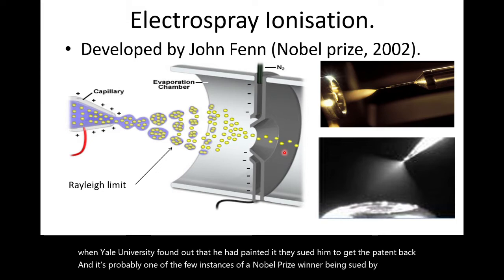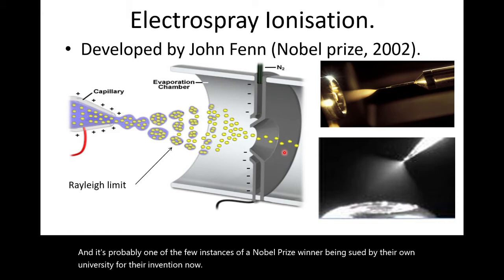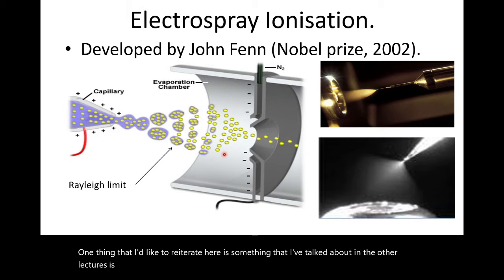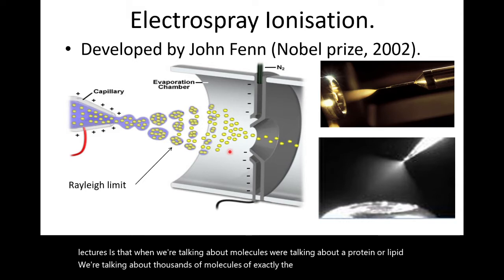Now, one thing that I'd like to reiterate here, something that I've talked about in the other lectures, is that when we're talking about molecules, whether a protein or a lipid, we're talking about thousands of molecules of exactly the same thing, and that becomes important.